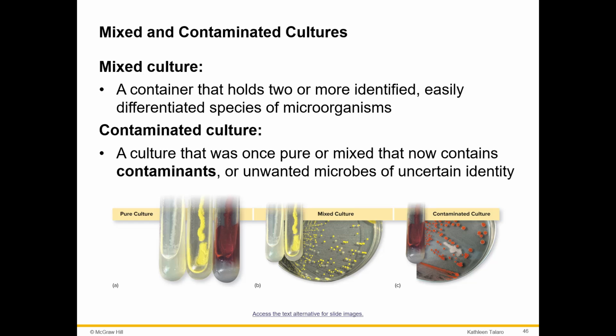If we were to take that spinal sample and the needle was not cleaned prior to using it, which would be absolutely terrible, or if the needle, when drawn out, happened to also draw in some mold spores from the environment, and we let that culture sit for a while, that's going to eventually produce that mold organism that was in there originally, especially if it's incubated at room temperature without the presence of light. You're going to see mold start to grow from there. And that mold is going to be contamination. It was a pure culture, and now there's contaminants.